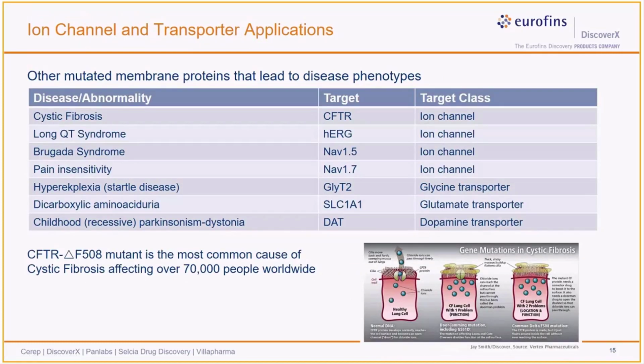All right, so now let's move into ion channels and transporters. We've got a few indicated here. It's a subset of all the ones that are known. The first example is right here. It's called cystic fibrosis, and it's specifically for a membrane CFTR receptor, an ion channel receptor, cystic fibrosis transmembrane conductance regulator. So it is a chloride ion channel with a mutation, specifically a deletion in phenylalanine, or F508. That's indicated down here. So deletion mutation.